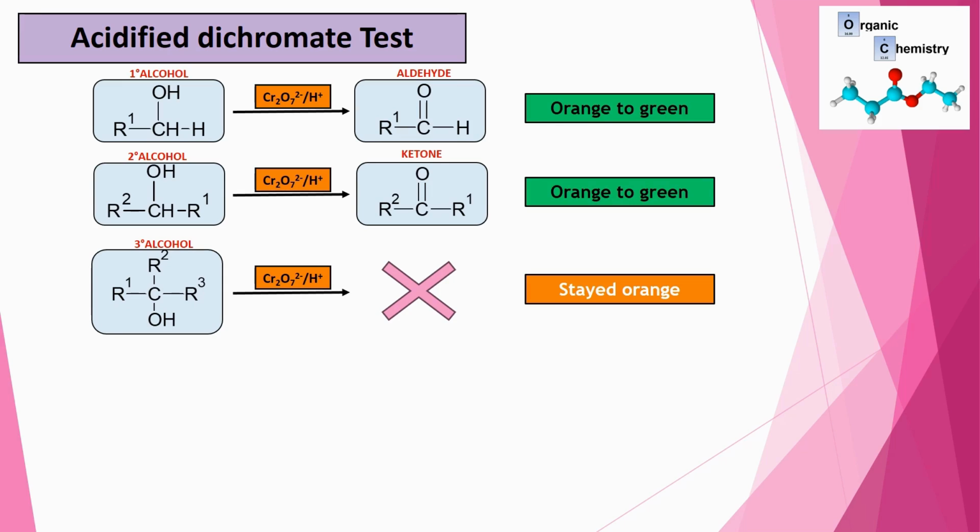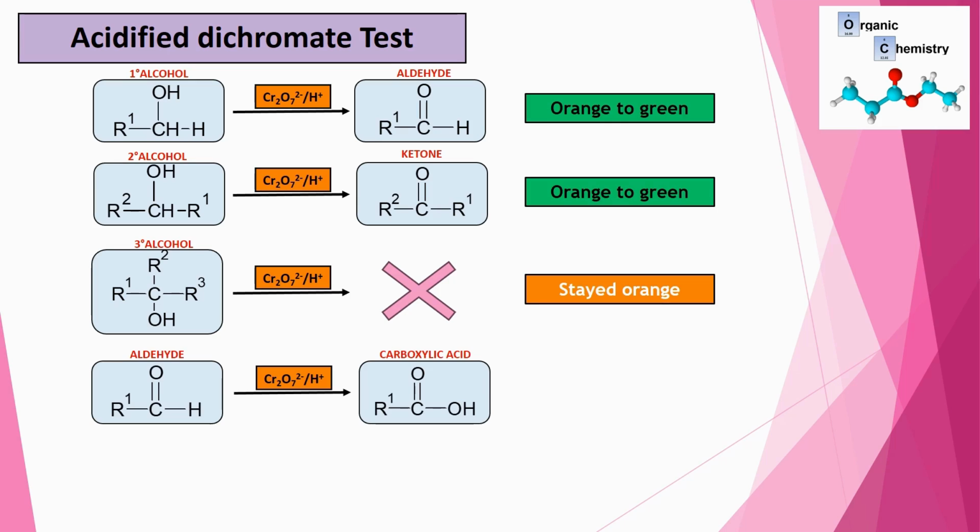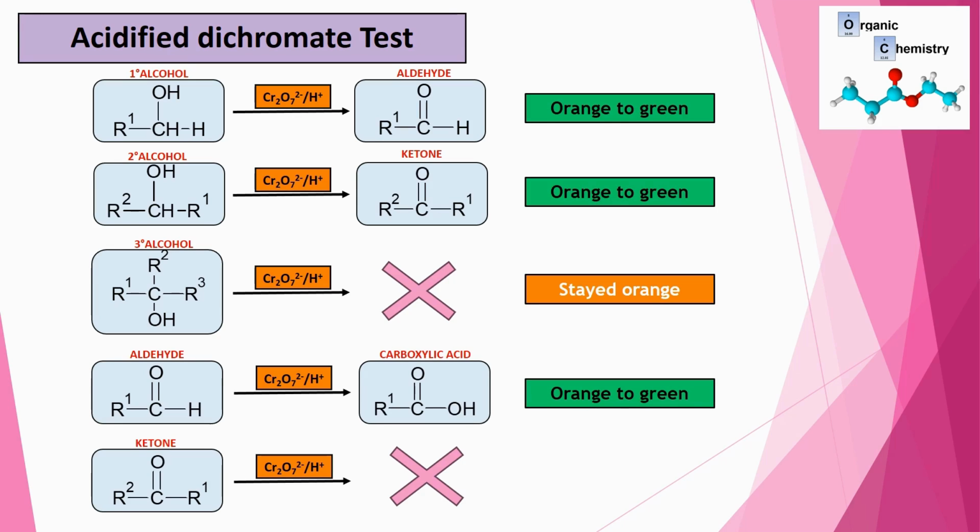The orange color stays. Aldehyde, again, will go from orange to green, and we expect that the ketone does not react. Okay, it stays orange.